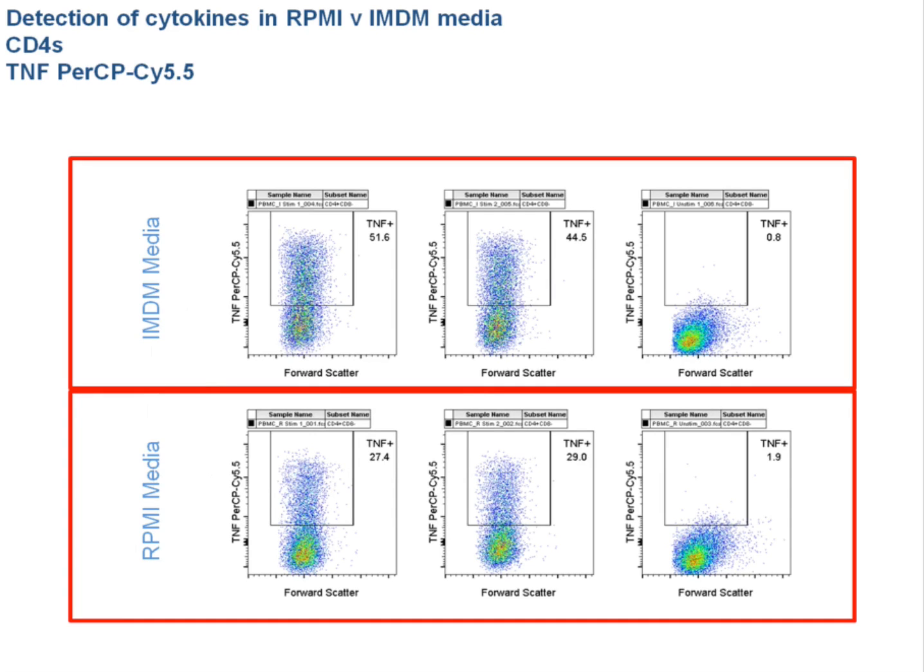But it's really a case of whether you can make do with just a few hundred cells, and if you can get robust statistics from that. So all I would really say is maybe plan your experiment so that you don't have unnecessary samples, so that you limit your sample numbers, and then you use as many cells as possible for as few samples as possible. Okay, thank you very much, Barry.